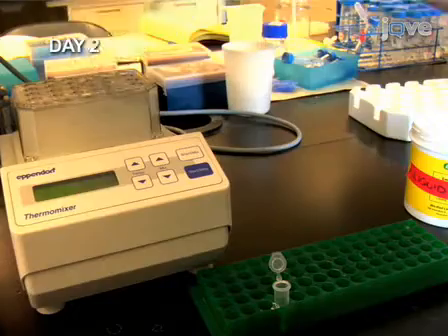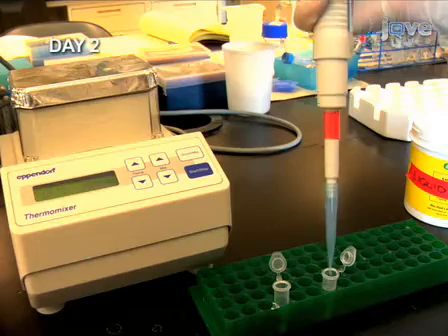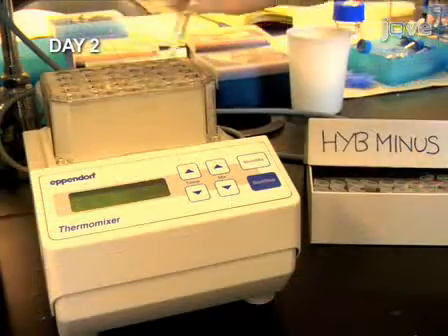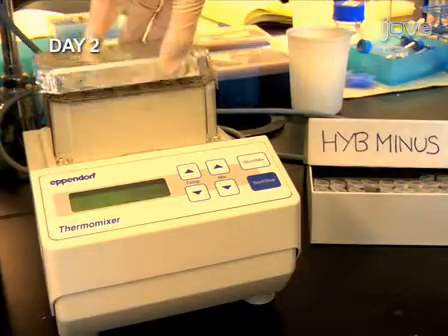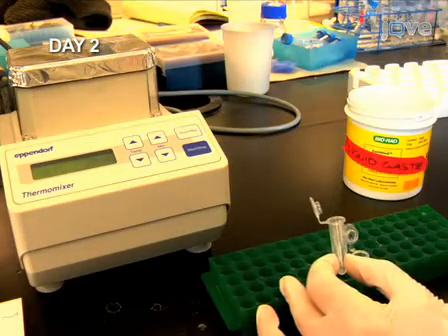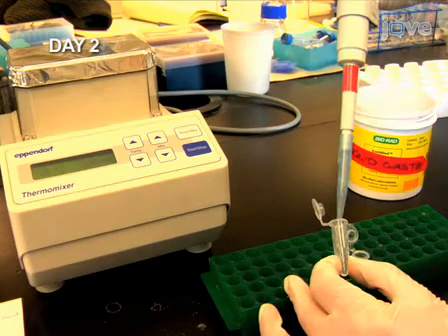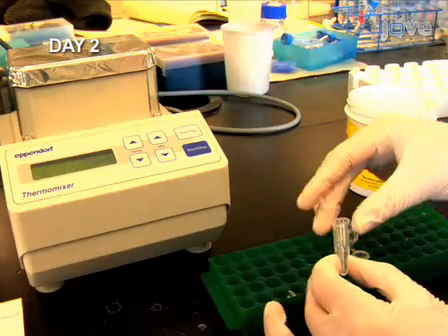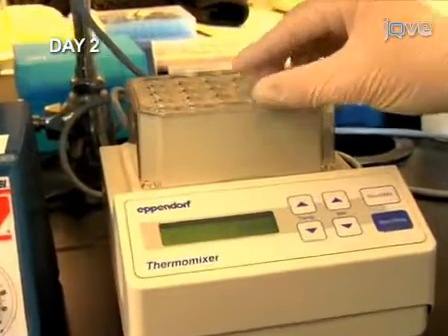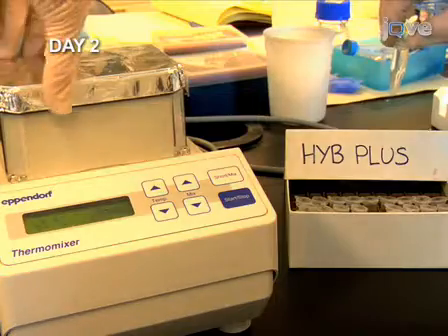Now that we've fixed and permeabilized the embryos, we begin the hybridization process with a 5-minute HYBE-minus incubation at 65 degrees Celsius. Remember to preheat the HYBE-minus solution before use. Next, incubate the embryos in HYBE-plus for 1 hour. Again, remember to preheat the HYBE-plus solution.